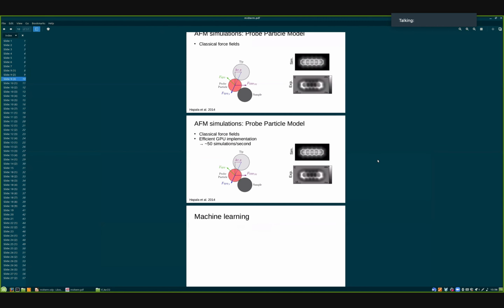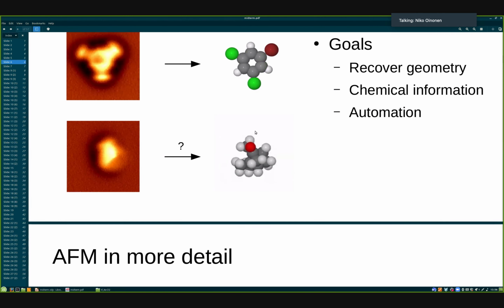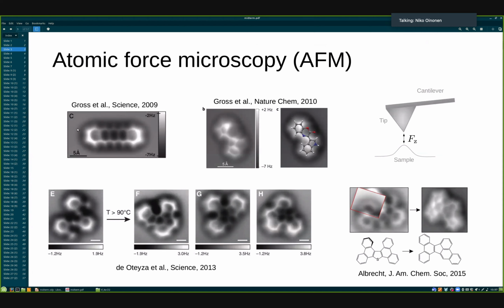So in our training set, most of our molecules are fairly three-dimensional examples. For example, this one is camphor, so something that looks kind of like this. And when we trained our model on these kinds of samples, we found that it often doesn't do quite as well on more flat things where you see a lot of atoms in the same plane, which is kind of ironic, considering that this is usually the easy case.